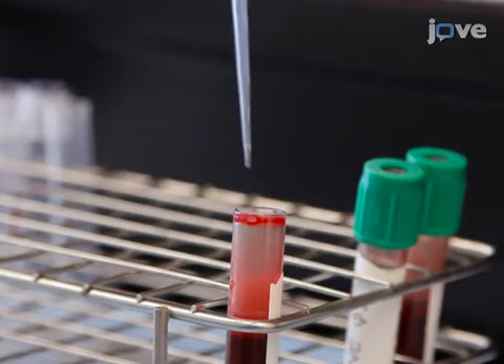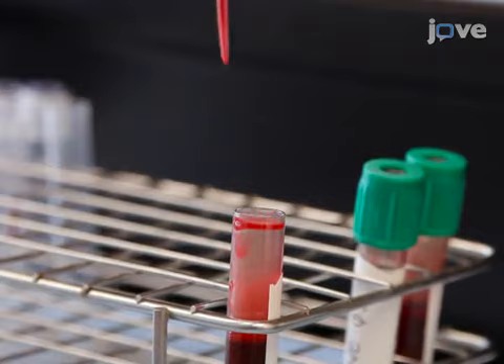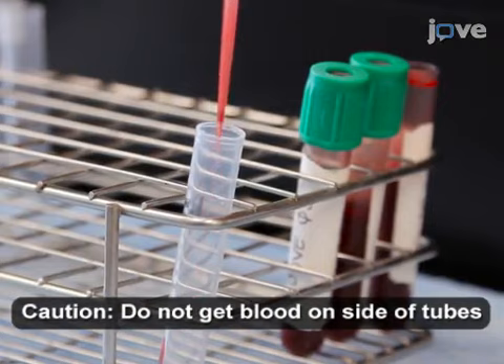Then for each experimental and control tube, use an extended length pipette tip to transfer 100 microliters of each whole blood sample from the lithium heparin blood collection tube to the bottom of an appropriately labeled 12 by 75 millimeter tube.